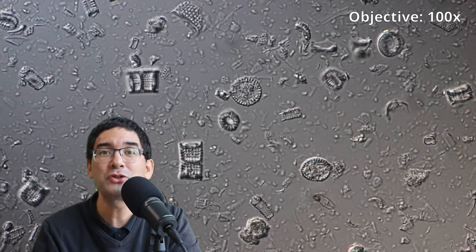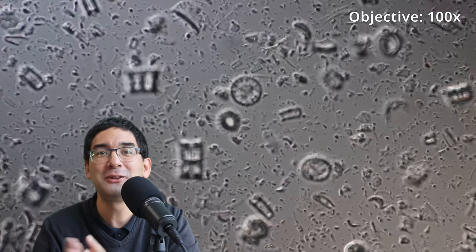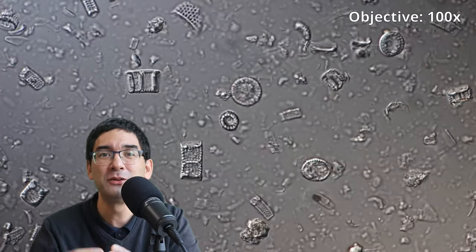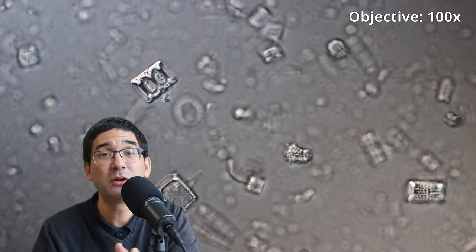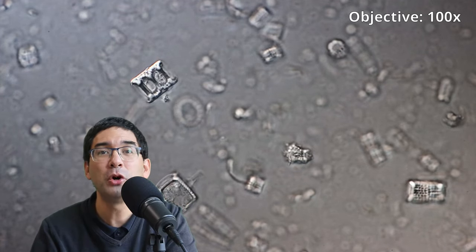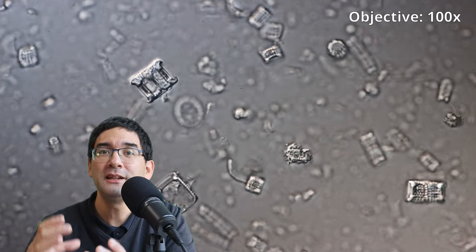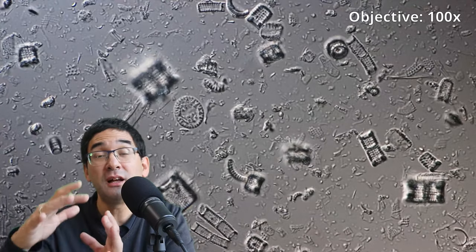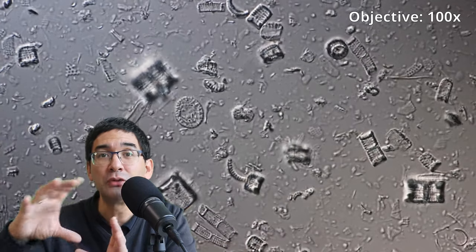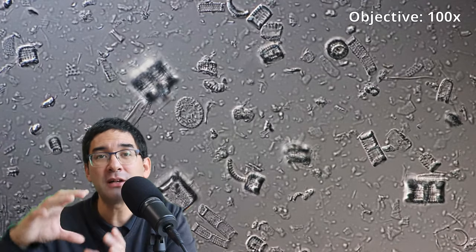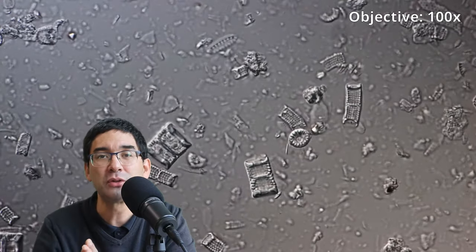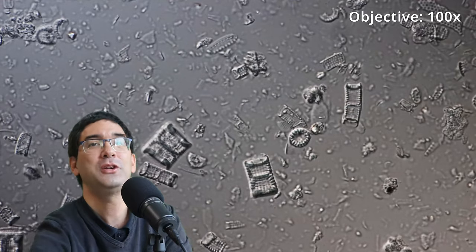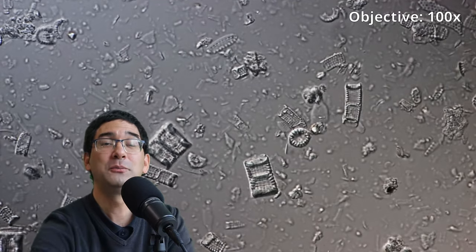Now diatoms under the microscope, you're quickly going to see that there are two different kinds. There are the elongated ones. They're called the pennate diatoms. And these are quite commonly found. At least I found them quite commonly in freshwater. And then there are also those so-called radially symmetrical ones that are either triangular in shape or they're round. And it doesn't matter how you rotate them. They always look the same as they don't have a left and a right side, but they're radially symmetrical. And in this diatomaceous earth sample, I found both of them.